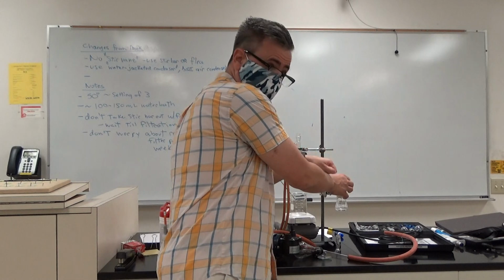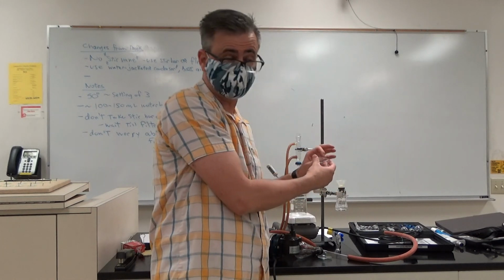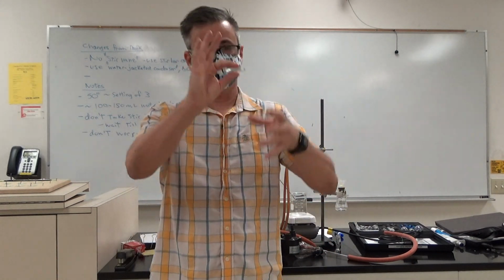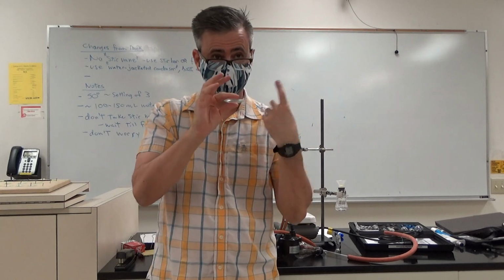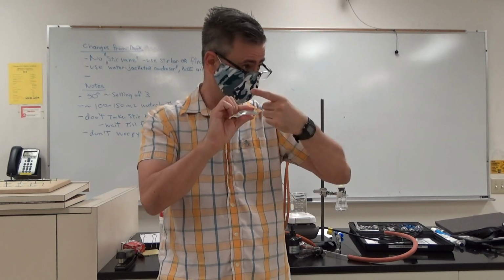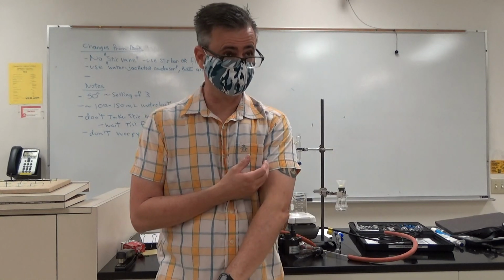You scrape everything on there, including the filter paper. All right? We can separate the filter paper much easier when it's dry. All right? We put it over, okay, make a little flying saucer. One piece of tape like that, don't mummify this thing, all right? We want it to dry, yeah? So we want there to be a little bit of a gap around the edges. So one piece of tape, all right? And then we write our name and aspirin, okay? And then it goes in our drawer until next week.